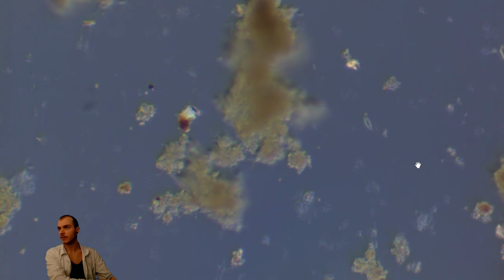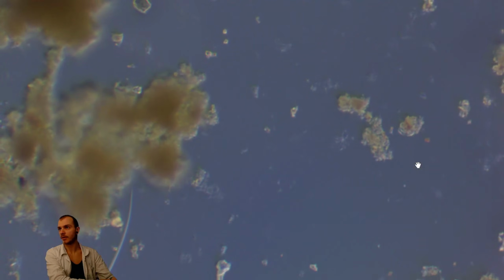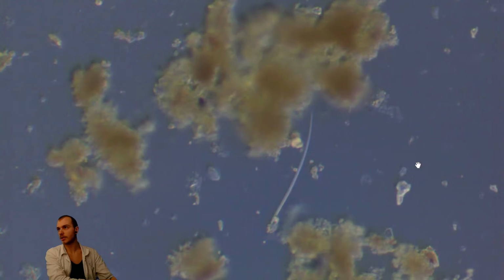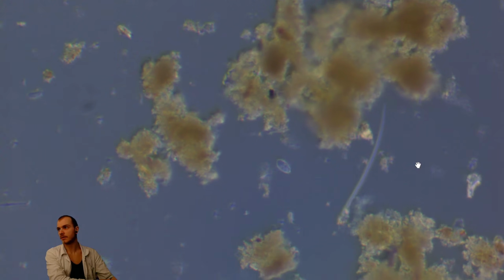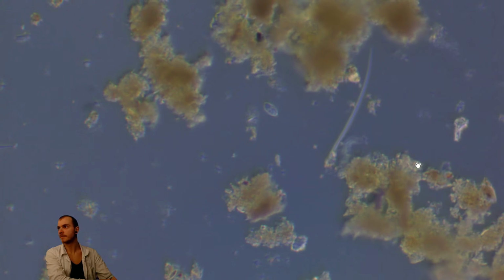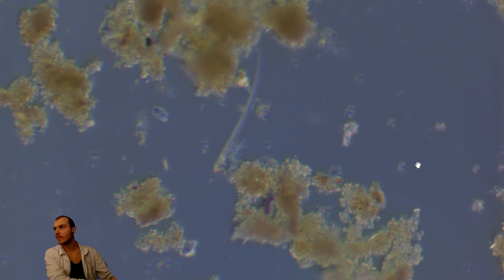And those small ones, I'm not sure if those are bacteria. This big one is for sure Eukaryota, some ciliate. This looks a little bit like amoeba.